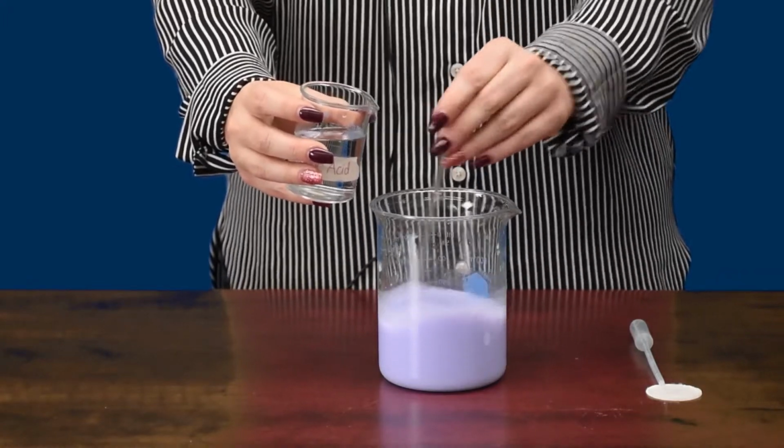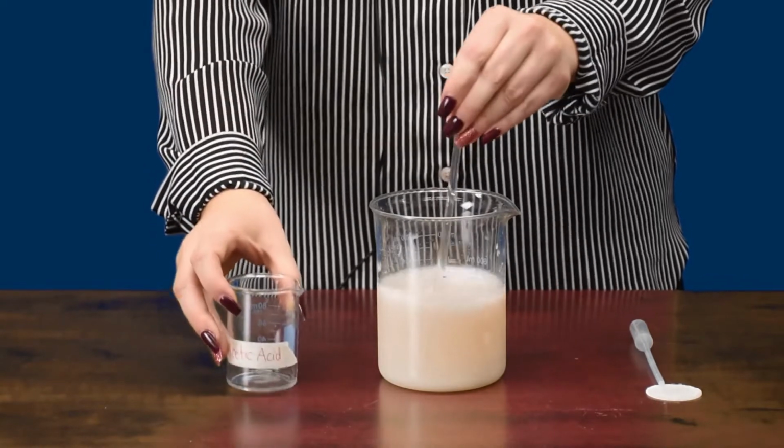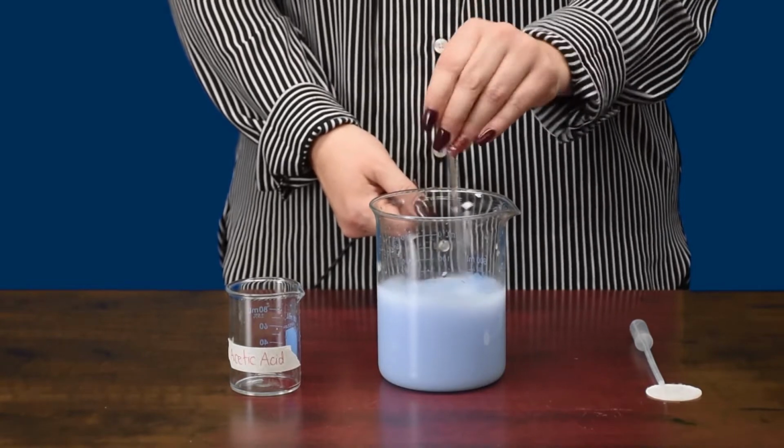A common question that a lot of students ask in this is, what if I added all of the acetic acid? Would this affect the rate of color change in our experiment? So what I'm going to do now is add the rest of this beaker of acetic acid. So this is now approximately 70 milliliters of acetic acid left in here, and I'm going to pour it in this beaker and we will see what happens. And there you have it. So instead of staying purple, our experiment is staying yellow, but still very slowly, the solution is going back to purple.